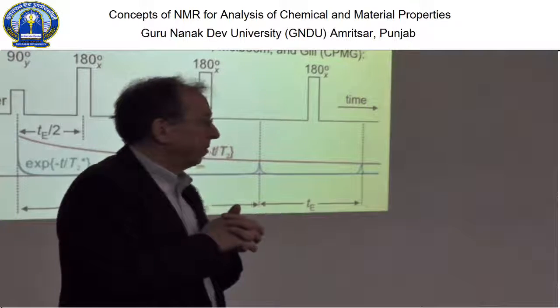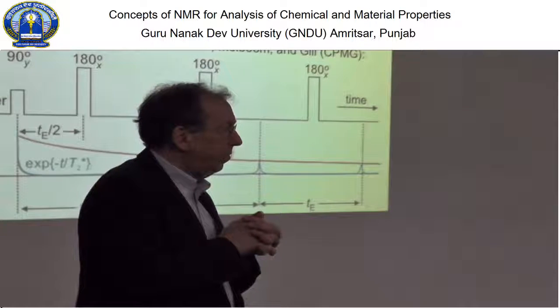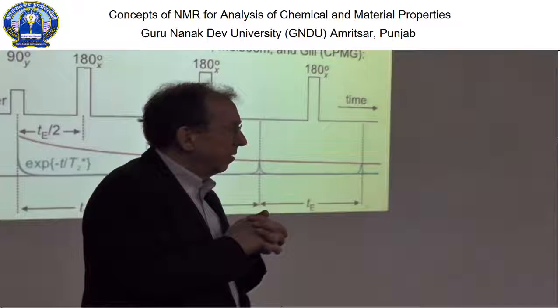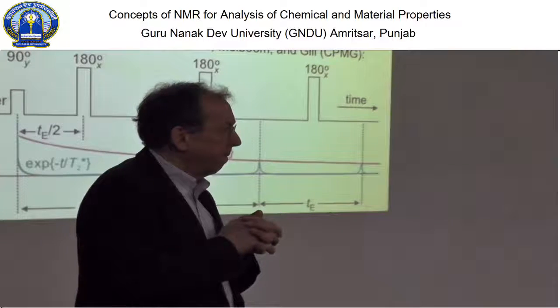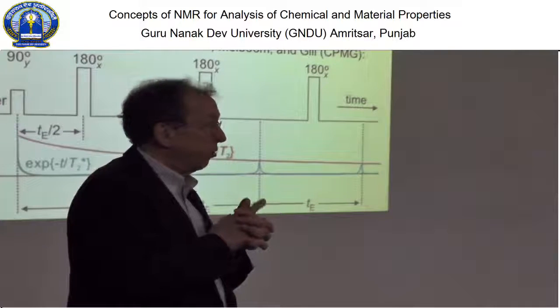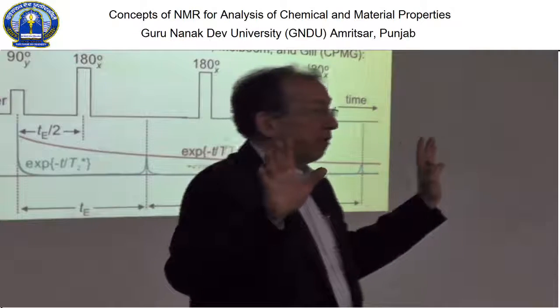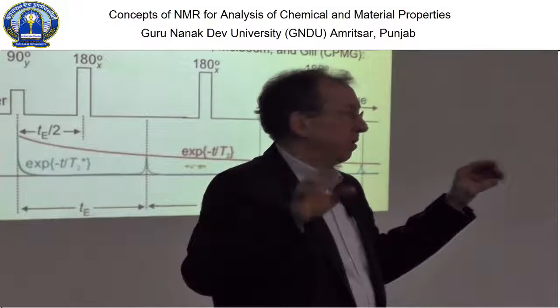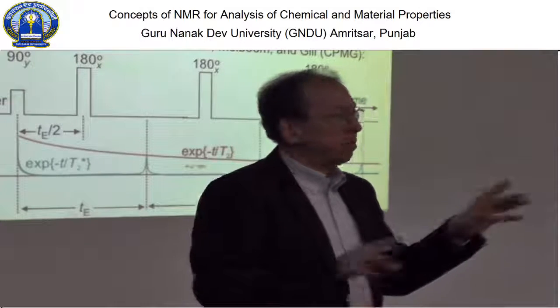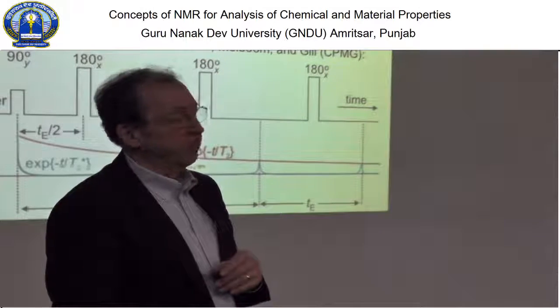But probably he's asking during the phase correction, the negative will go out. And it will be only the positive that will be visible in the form of signal. No. Both will stay. Both will stay. If you do the right phase correction, you said. No, both. You can do that for positive and negative frequencies.